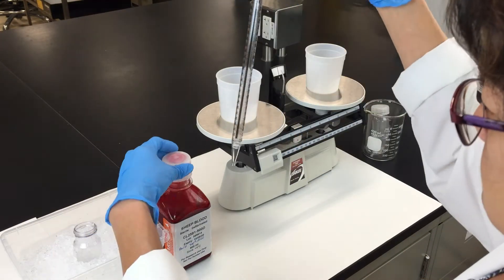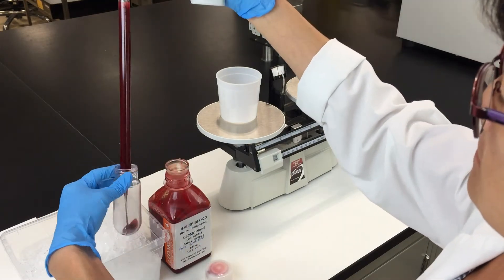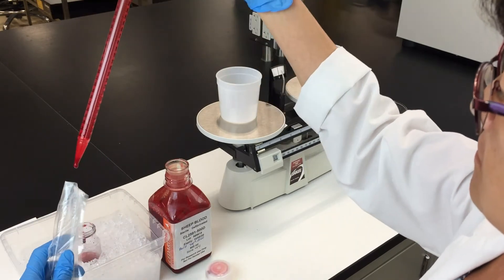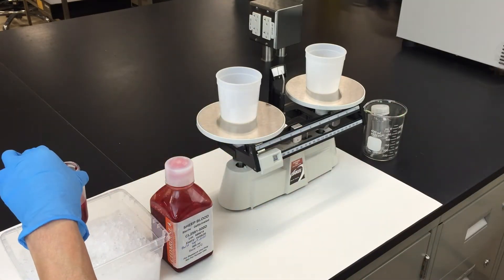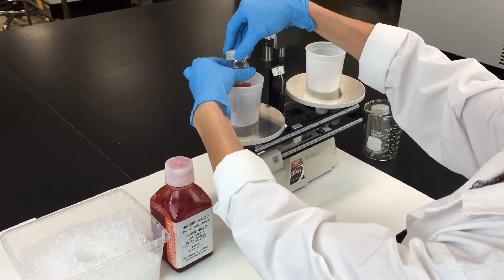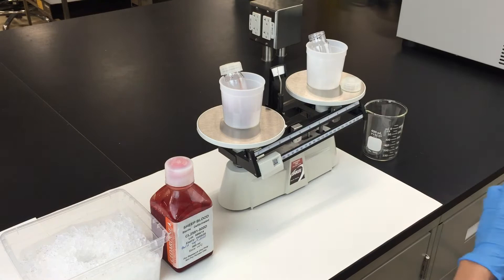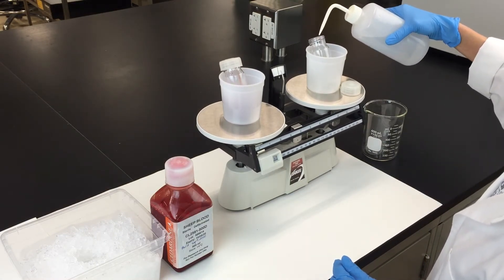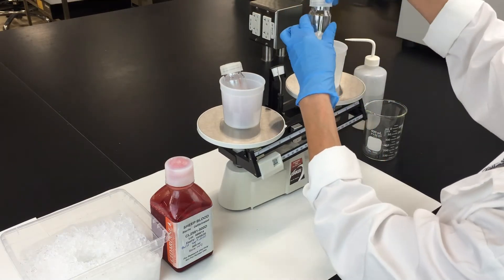Using a sterile pipette, transfer 30 ml of the blood to a centrifuge tube. Now you want to balance the tube with a second tube filled with water. Once the tubes are balanced, you're ready to centrifuge.